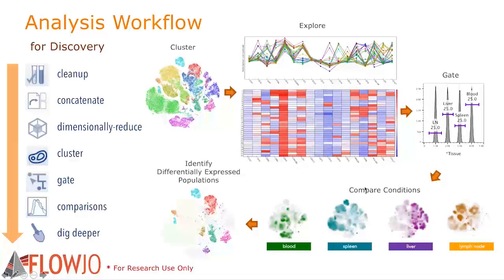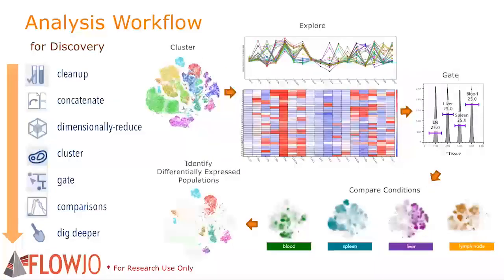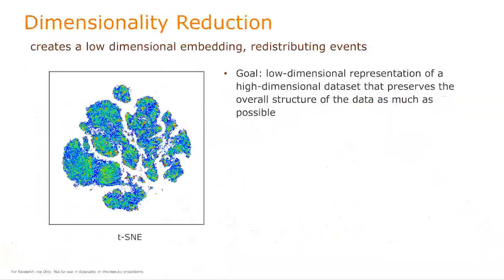And so as long as you get the concatenation step down, which method you use to display those populations within a dimensionally reduced embedding, and which method you use to subset into cluster populations, it is really just which tool is best for your use in terms of how fast it runs, how many populations it'll make, whether you have control over visualizations as part of that process, and such. So that's the workflow that I'm promoting, because I think it actually works to answer those questions of what's in my system and how do those populations change across the conditions.